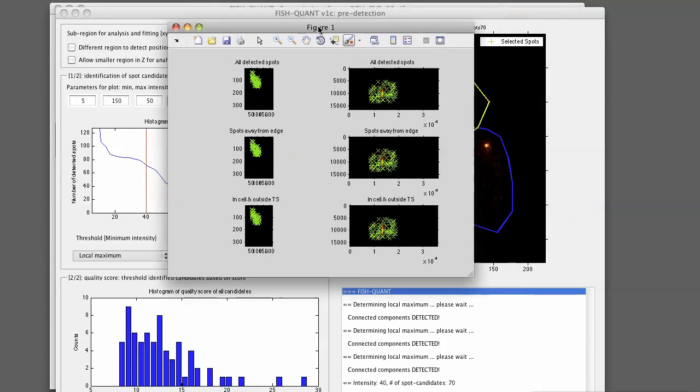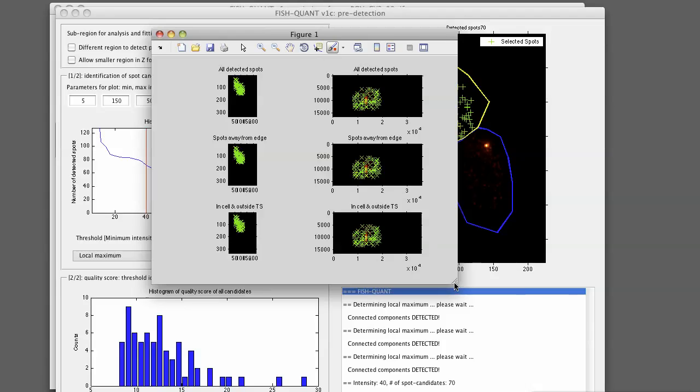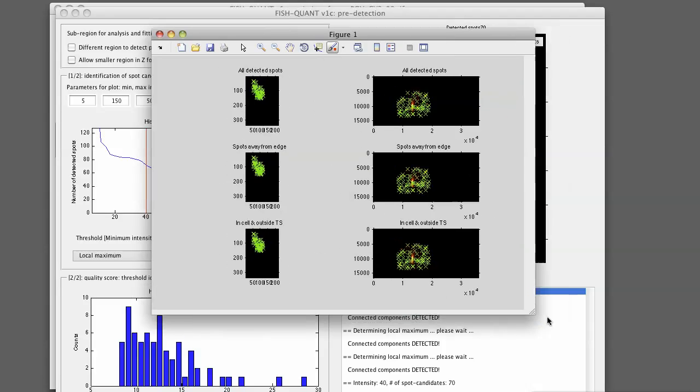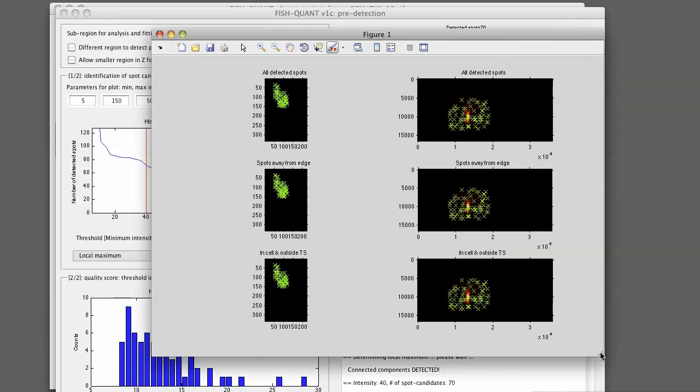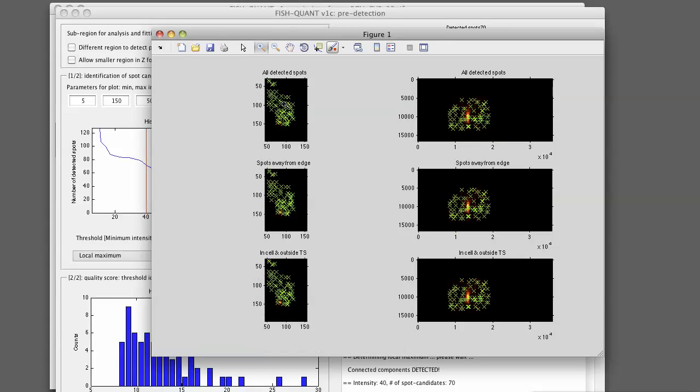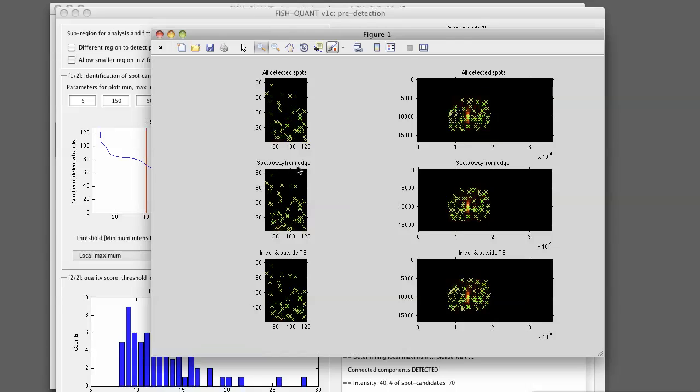So you see here now a plot that shows up where you see all the detected spots, an XY projection and an XZ projection. You can zoom in. FishQuant will, by default, remove all the spots that are close to the edge in Z and spots that are inside of a transcription site.